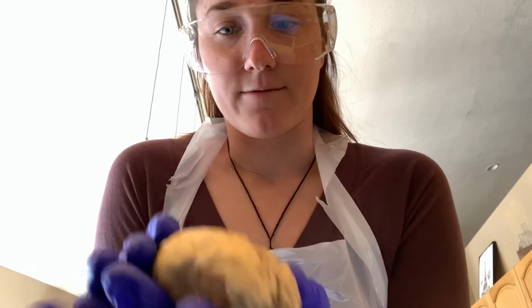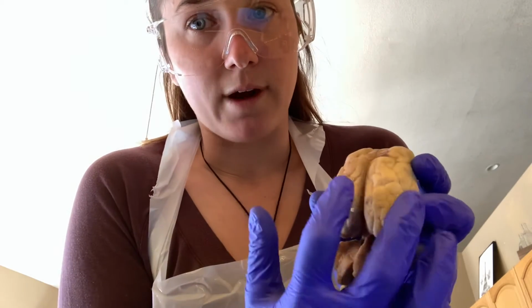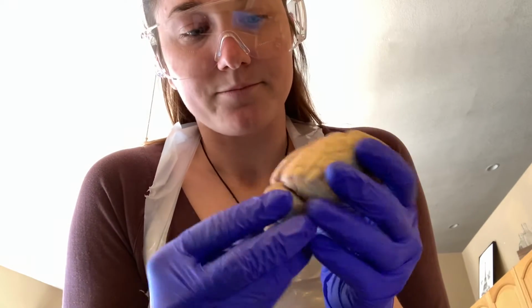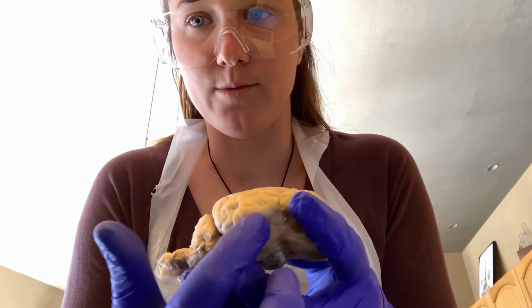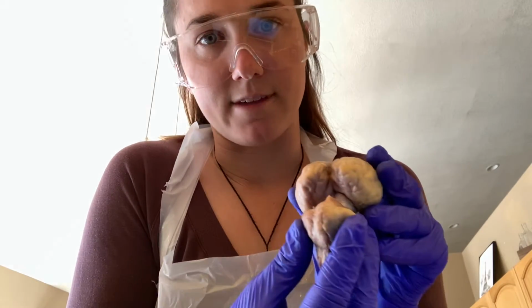So here in the front we have the frontal lobe, and then we have the parietal lobes on each side, and then we have the temporal lobes located down here on either side, and then in the rear here we have the occipital lobe.